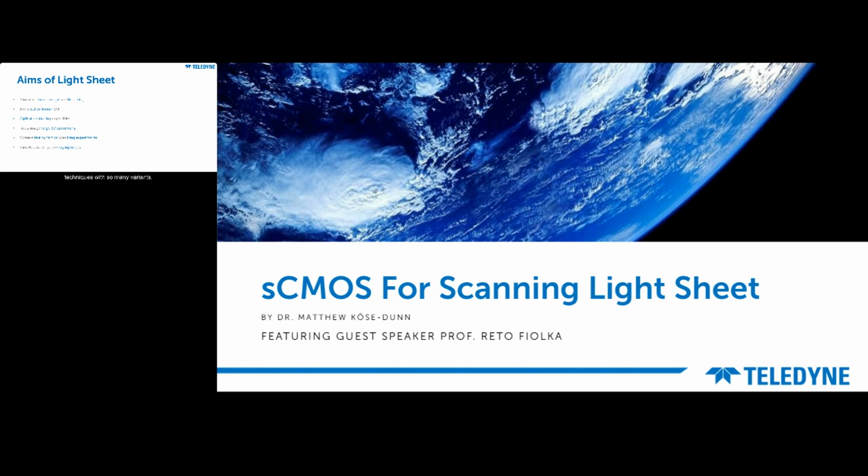Light sheet is one of those techniques with so many variants, sometimes we run out of letters of the alphabet for naming acronyms. Essentially, light sheet holds a lot of promise and is a rapidly developing field for this reason. And most of the aims of light sheet are achieved by the way that illumination and detection are treated differently when compared to typical wide field imaging.